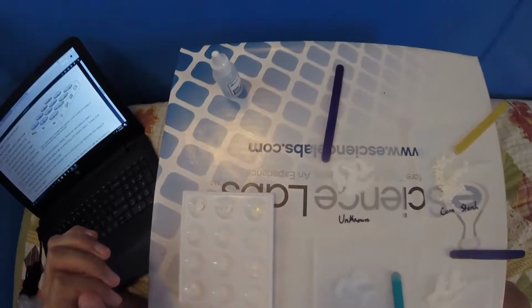Okay, so each one is having sort of an effect. The one that had the greatest effect was the sodium bicarbonate. That one was definitely fizzing the most, but all of them did have an effect except for the cornstarch. The cornstarch had little to no effect. It just kind of drowned in it. The sodium bicarbonate definitely fizzed up the most.